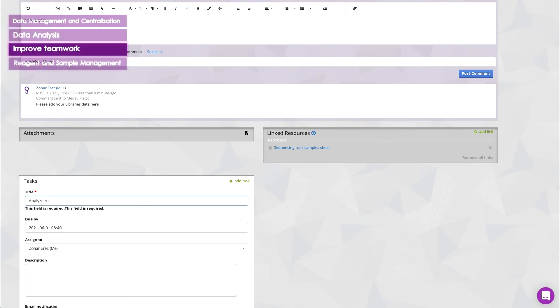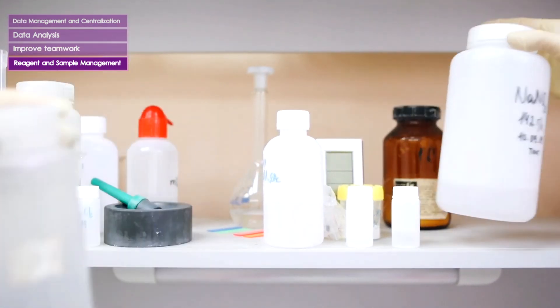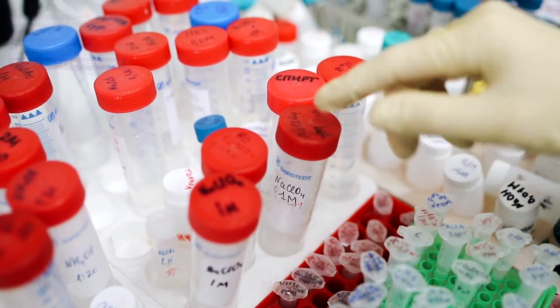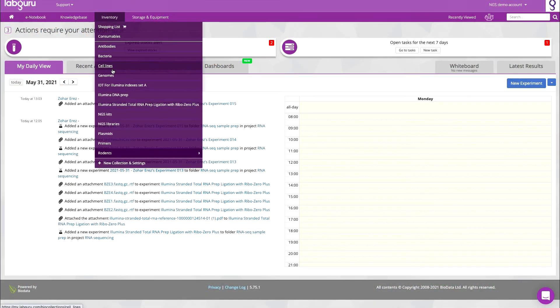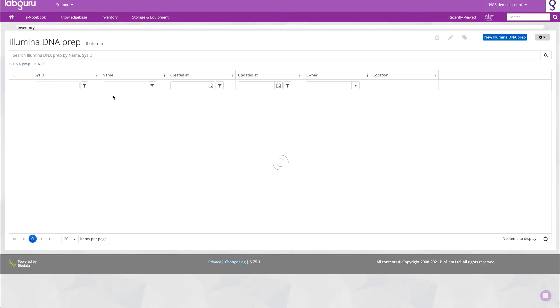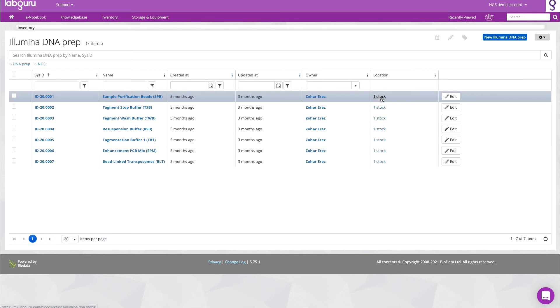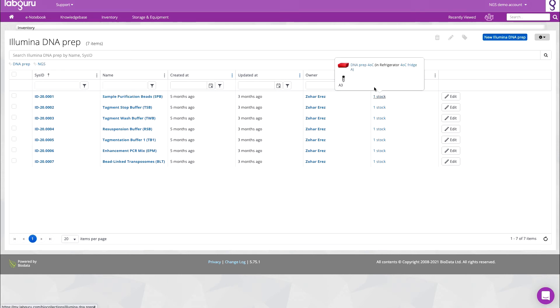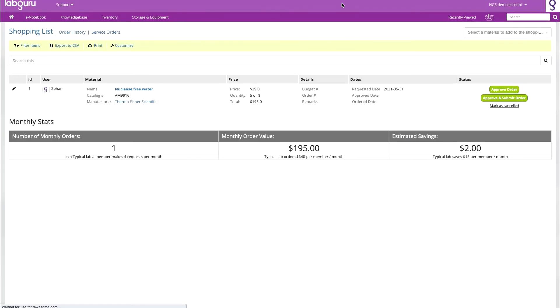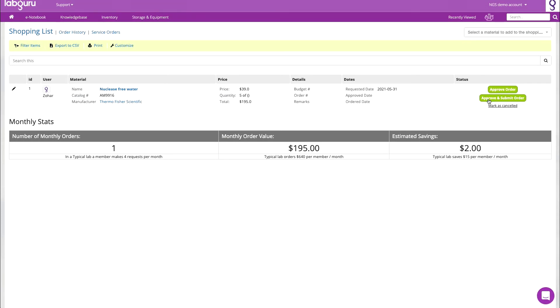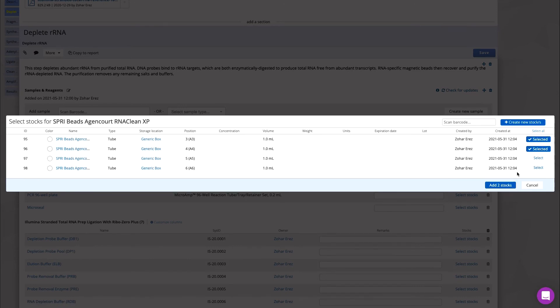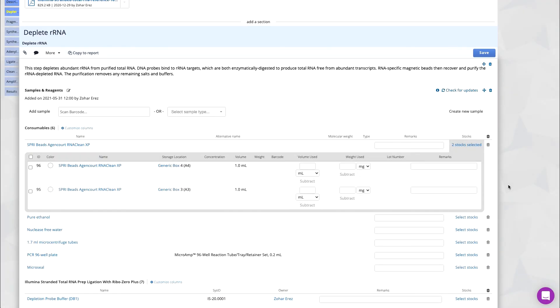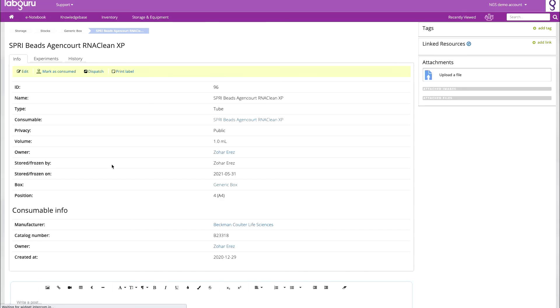Last but not least, the challenge of reagent and sample management. LabGuru does more than organize your experiments and results — we've got all your lab's needs covered. Use the inventory and storage modules to manage your samples and reagents. Track the location, amounts remaining, and expiration date of each stock. Never run out of supplies again. Add stocks to your shopping list, manage and approve your lists, and connect inventory data to experimental data. You can even add the specific stock you used to your ELN entry to track exactly what was used in every experiment.